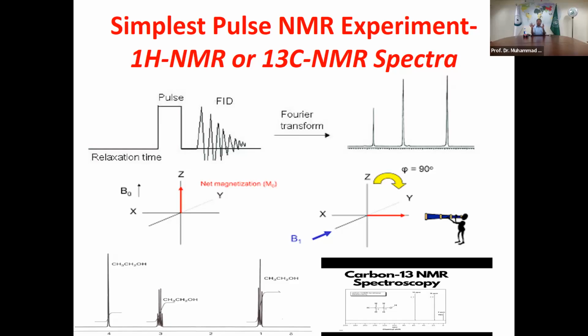And now, there are literally experiments in which you have not one, but thousands of pulses. You just play with that. If you understand what happens when you give a pulse, where it will go, and then there is also a concept which we will discuss with you, called the rotating frame of reference, where these vectors are on the XY plane, then you would be able to understand this multi-pulse NMR experiment, which we will discuss later.